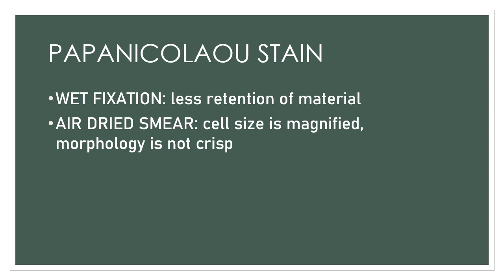That is why there are modifications in this Papanicolaou staining, to improve the staining quality.